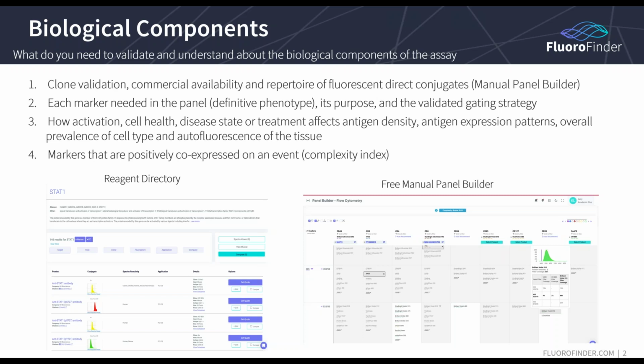In those instances, often I will use fluorophores like FITC or BV785, because in their variability of how much is expressed and how it's expressed, it's going to interfere with other channels less, because neither of them have a particularly strong spillover pattern into other channels.